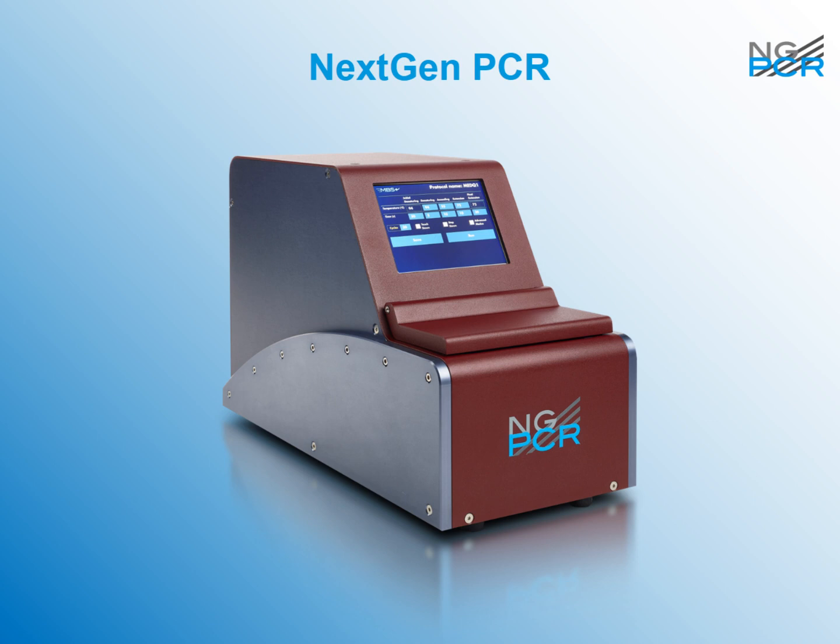During today's presentation, Gert will focus on the technology behind NextGen PCR. He'll pay special attention to publications detailing 2-minute PCR data and how NextGen PCR amplified all 29 fragments of the BRCA gene in less than 10 minutes for subsequent Sanger sequencing. So, Gert, I hand over to you. The floor is yours.